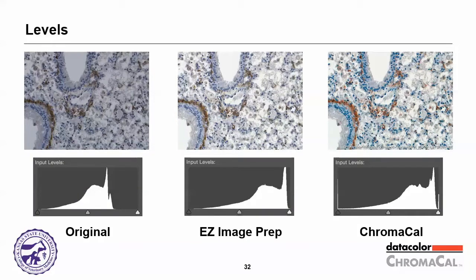I did this last night, and this is where I might have Mark jump in for a moment. Basically, I took each of these images into Adobe Photoshop. And if you go into Adobe Photoshop, where I used to play to adjust my slides, you go to Adjust Levels, and you can play around with the histogram and the range on that, and change the input level such that you get a different output and a different fit to that histogram.